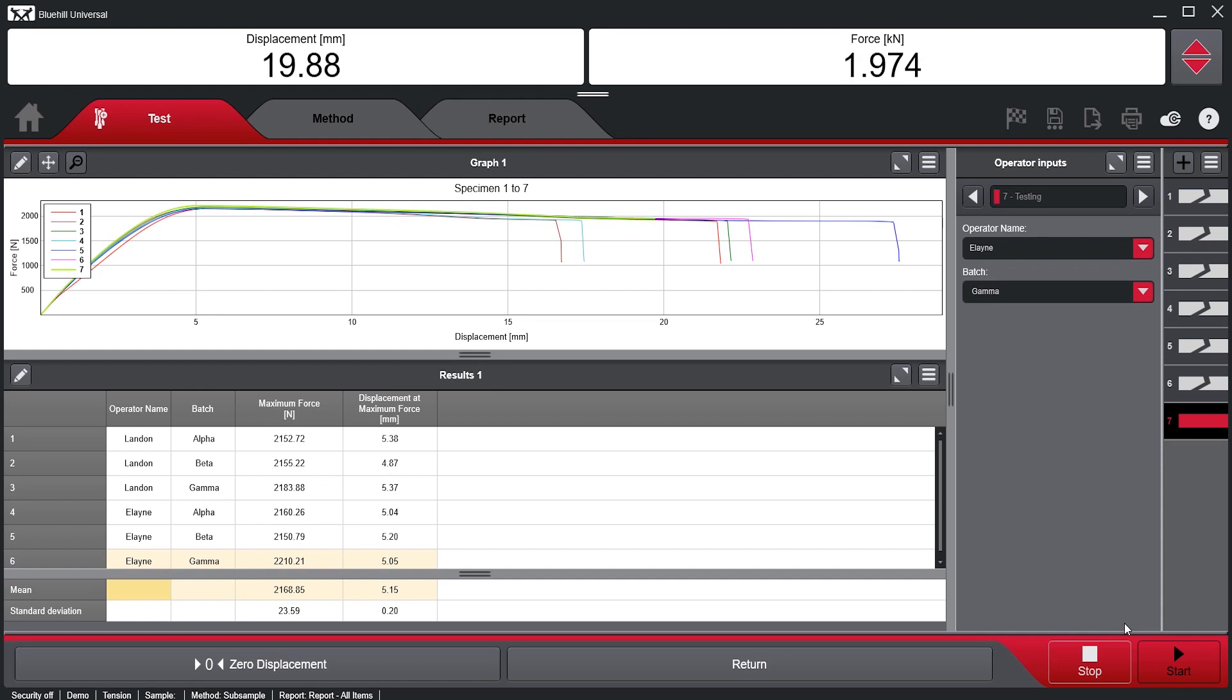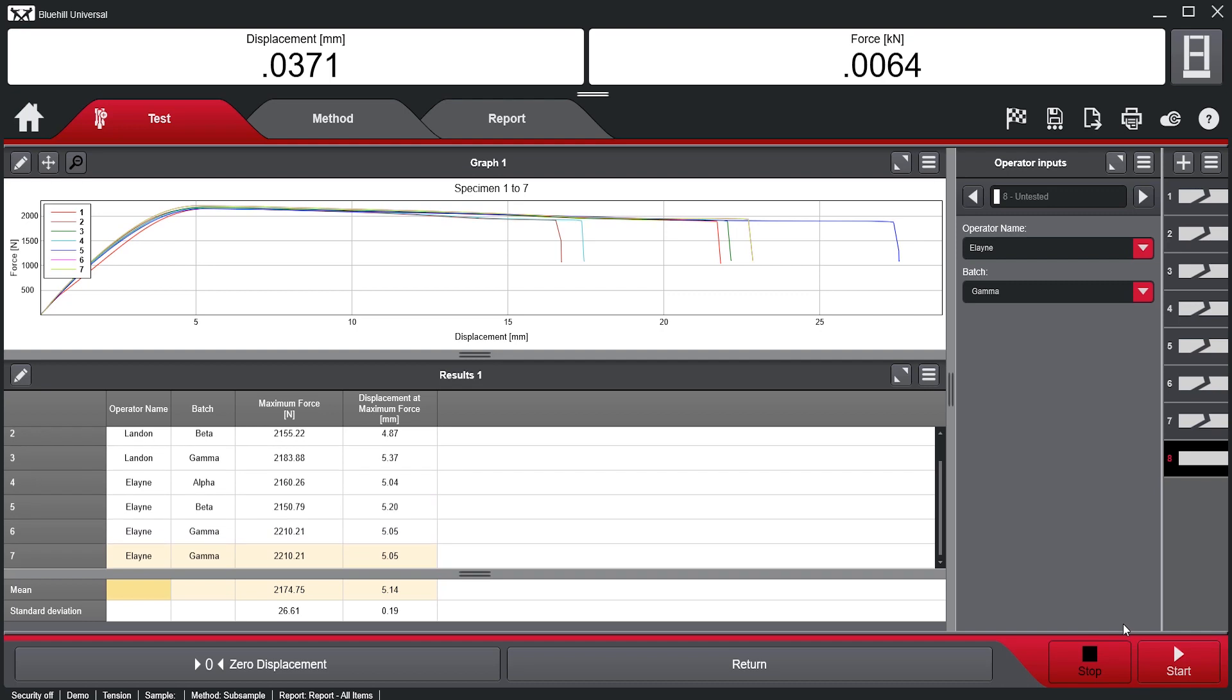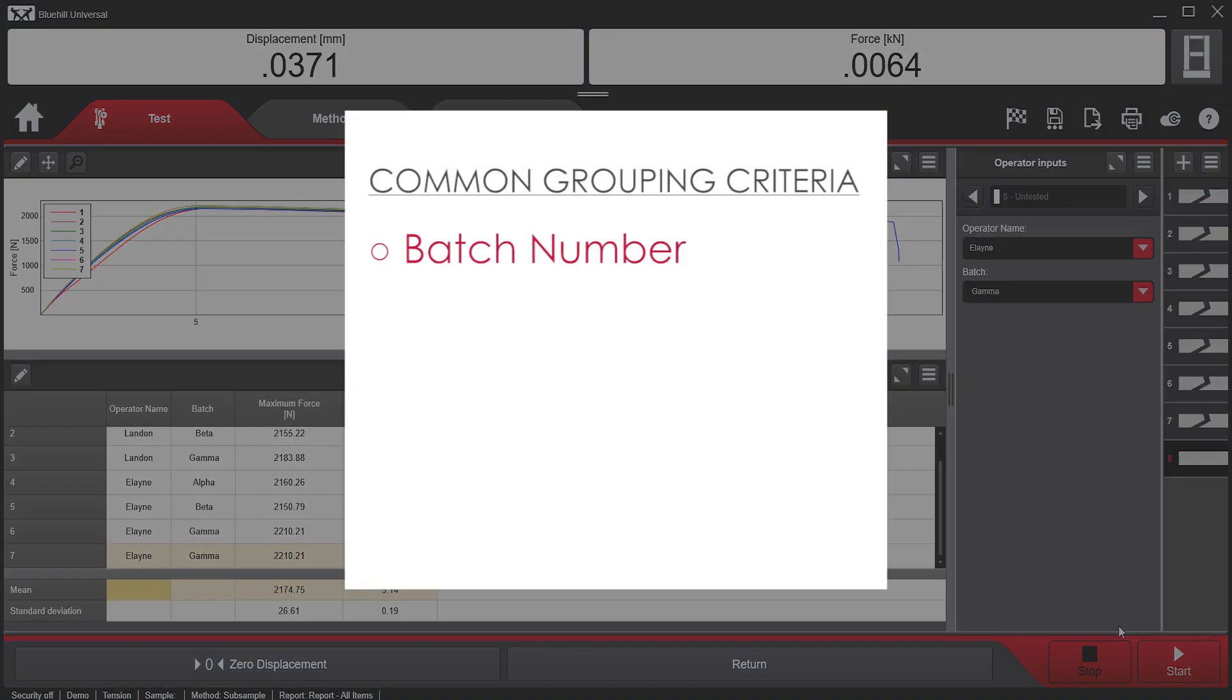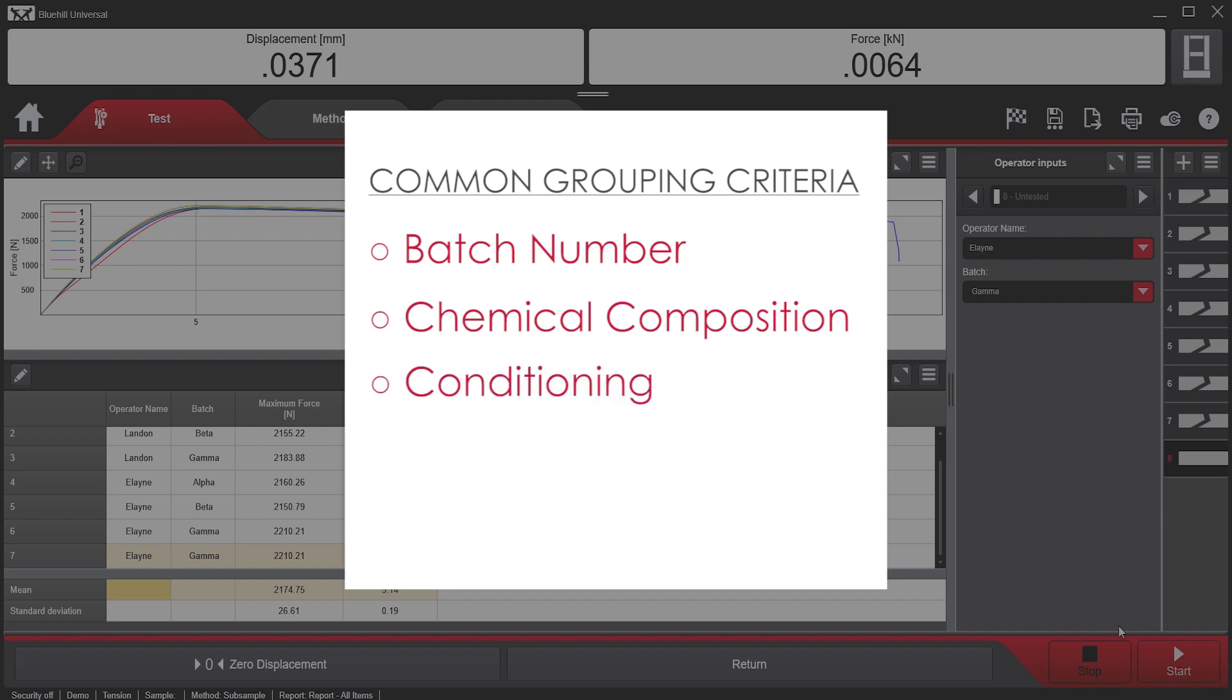However, in many cases, the sample consists of various specimen types with many differentiating factors, such as batch number, chemical composition, conditioning, operator, orientation, and many more.